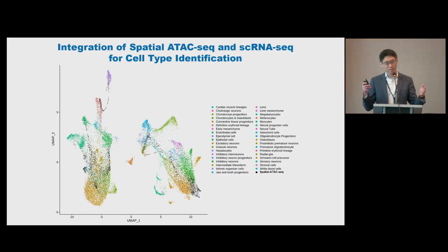So that's a simple approach to find out what major cell types are in which pixel. We're not a computational biology lab. Actually, the computational folks can do an even better job. They can resolve not just the major cell types in each spot, they can also further deconvolute each spot to identify even some minor cell subsets or a mixture of different subsets. But we try to just figure out the major cell types in every single pixel and then go back to see where the different cells are in the tissue.